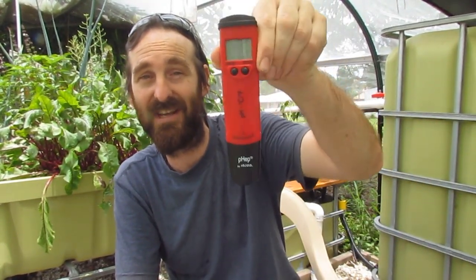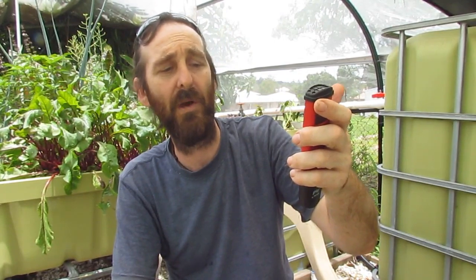So what am I using to do the test? Well, I'm using the API Freshwater Test Kit. I'm not flogging a brand or anything, it's just the one that seems to be most accurate for most people. I'm not using their pH test though — I had problems with their pH test in the past and wasn't getting accurate readings. They might have been heat affected; I just didn't trust them. So I went out and bought some test tape and that seems to work alright, and then I splurged and bought a test pen. For people who want to know, I'm using a HANNA HI98127 test pen, which is for pH and temperature as well.